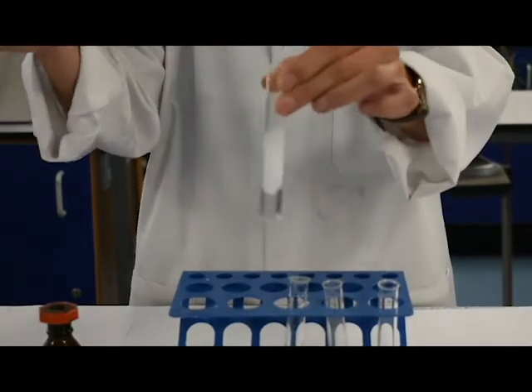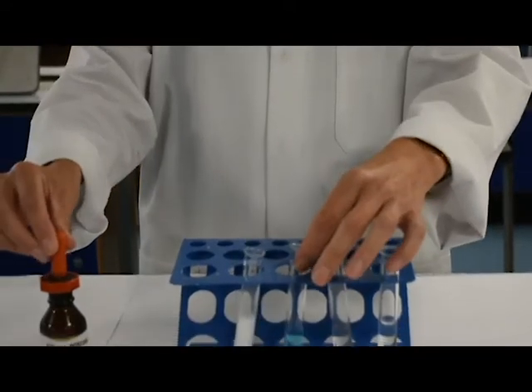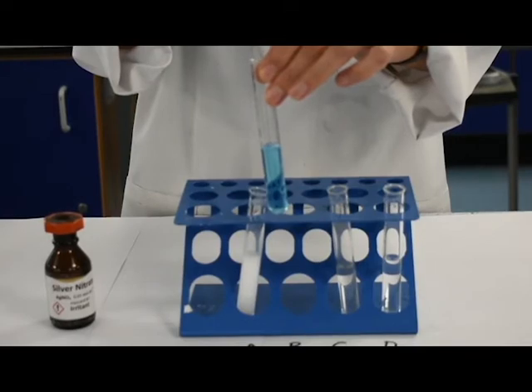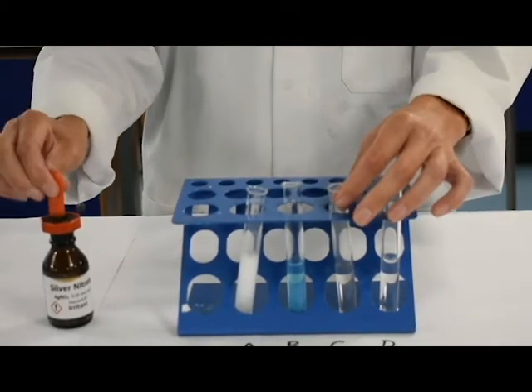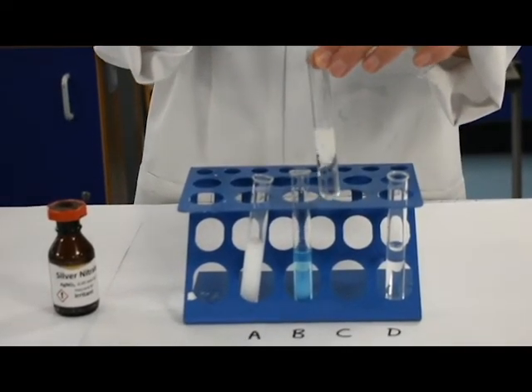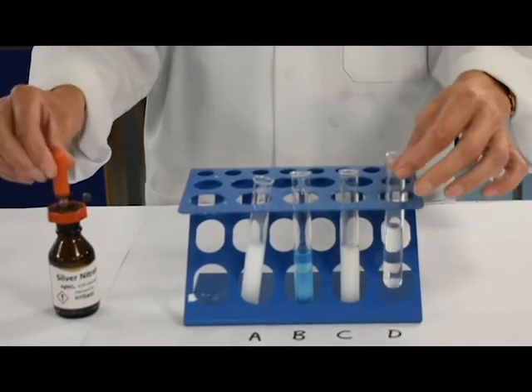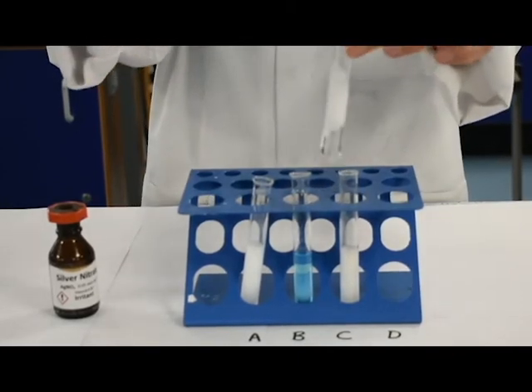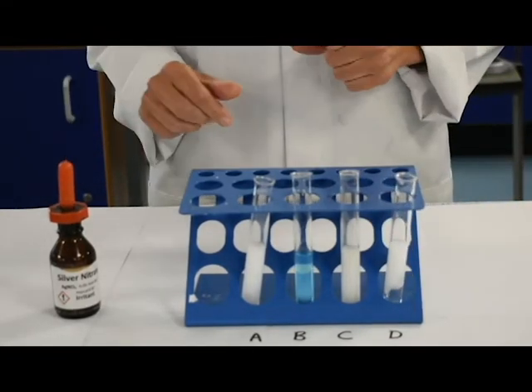So solution A, just give that a little shake. And now solution B. And now solution C. And finally solution D. So you should be able to fill in the first column of your results table now.